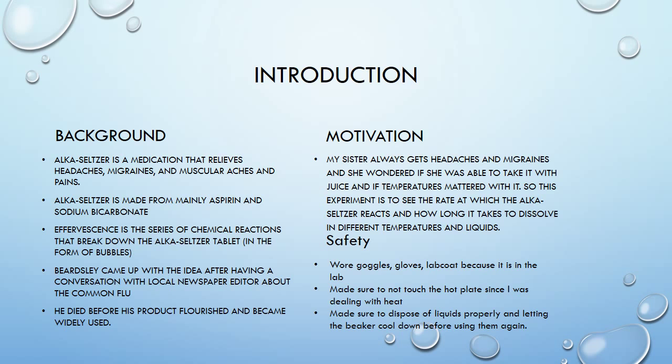For some safety, I wore goggles, gloves, and lab coats because it was in a lab. I made sure not to touch the hot plate since I was heating up materials, and I made sure to dispose of liquids and let it dry and cool down before I touched it again, just so that everything would be correct.